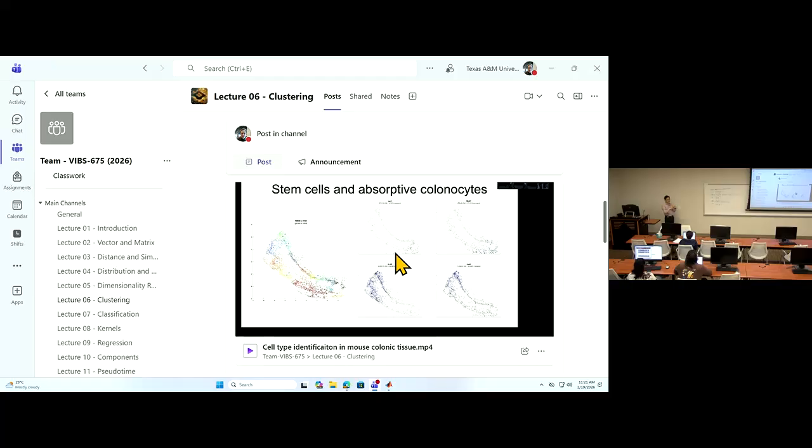Sometimes it works, but then sometimes not. So you need to have this very detailed sub-clusters of a cell group and work on each small group one by one and look at the markers and look at, okay, those subgroups should be merged, considered as one branch, and another should be another. So Michael just demonstrated very well in this case how this cell annotation should work. So that's a very valuable exercise, and I use this as an educational tool to help you to understand how, at this stage, this manual annotation should be done.